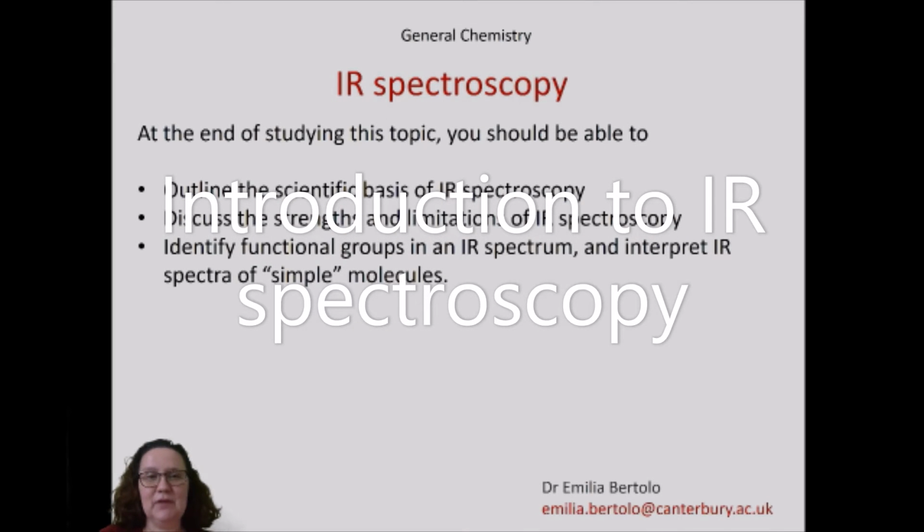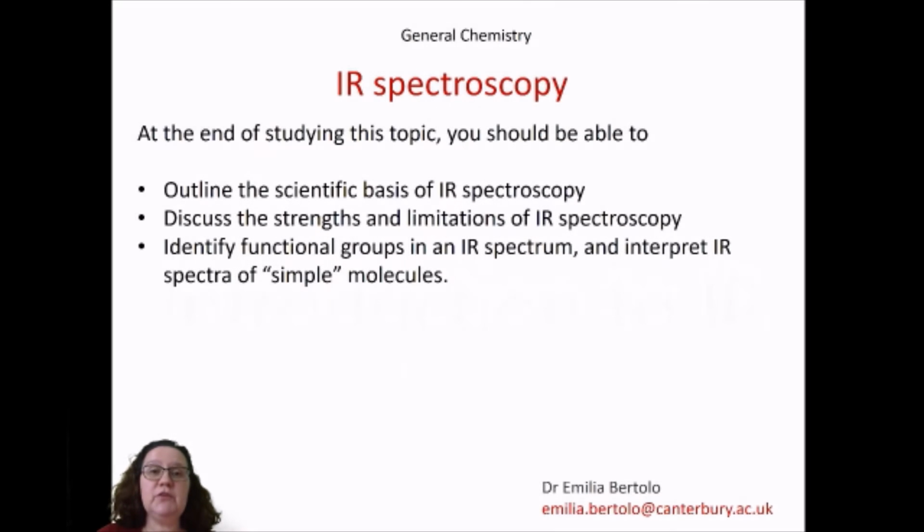Hello everyone! This is the first of a series of videos dedicated to infrared spectroscopy. In these videos we will be looking at the scientific basis of infrared spectroscopy, and we will learn how an infrared spectrometer works. We will also discuss some of the strengths and limitations of infrared spectroscopy. Finally, we will see how we can identify functional groups in an infrared spectrum, and we will learn how to interpret infrared spectra of simple molecules.